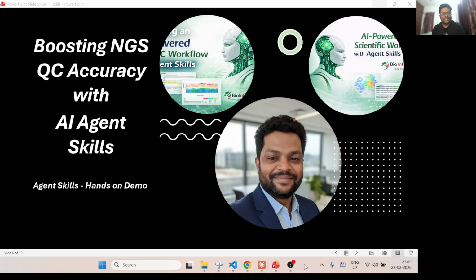Hi everyone. In this video, we will do a hands-on NGS QC analysis, but this time we will use agent skills. Basically, we will document the QC analysis best practices in a document, and we will tell our agent to use that skill document and do our NGS QC analysis. So that's what we will be doing. Let's get started.